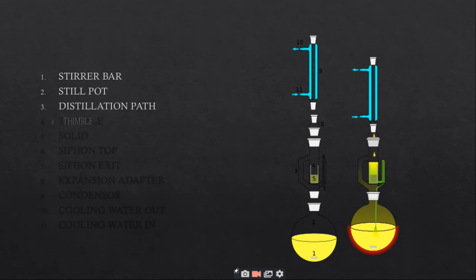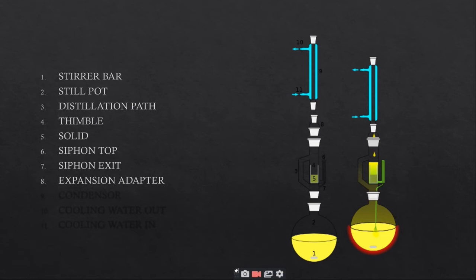Number three shows distillation path. Number four is thimble. Number five is the point where the solid is loaded. Number six shows siphon top. Number seven is siphon exit.